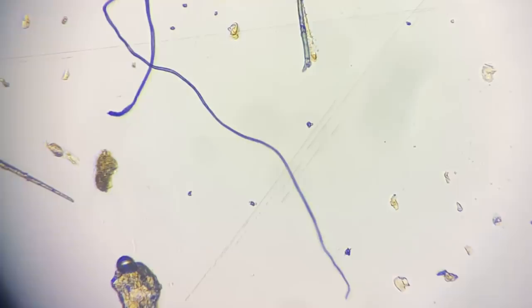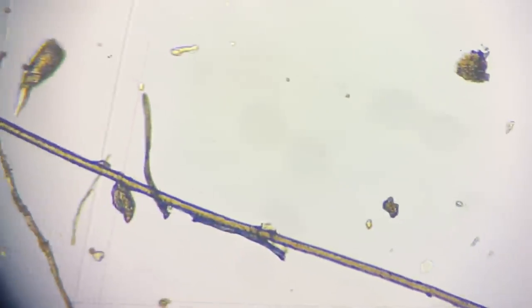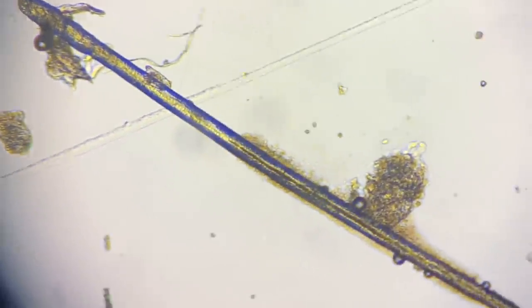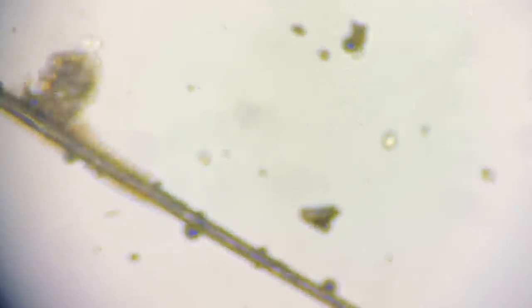I mean, I guess it's tiny. It's this tiny little thread that came off of some of my clothes or a bed sheet or something. Oh, that's a big ol' hair. Whoa, it's huge. Oh my God. What? How is that on my glasses? We need some anti-stick technology on glasses, you guys.